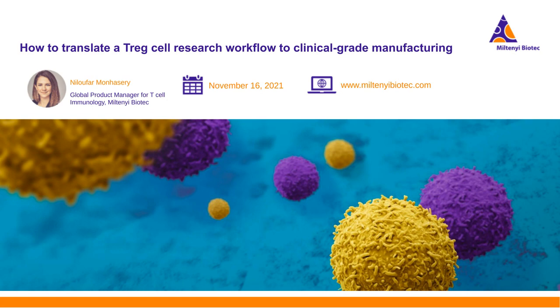But you should keep in mind, when you want to go for naive Tregs, for sure you are looking for more rare cell types, and your recovery might be lower. Sometimes I hear that with the CD4, CD25 kit we reach a better recovery. Why can we not reach that recovery with the other kits?